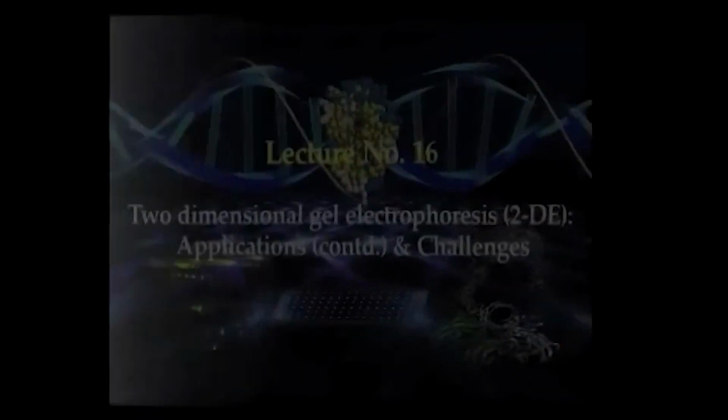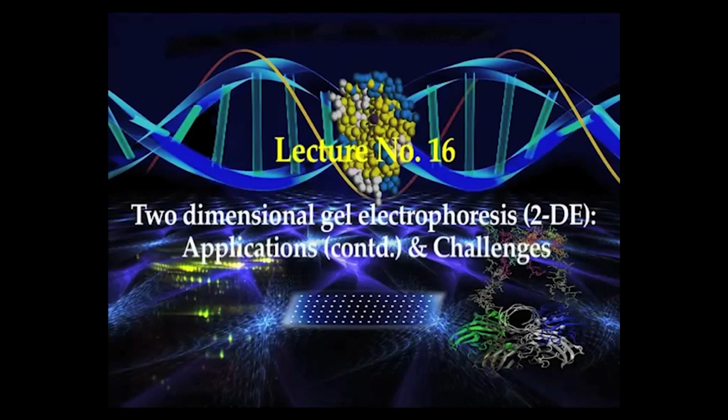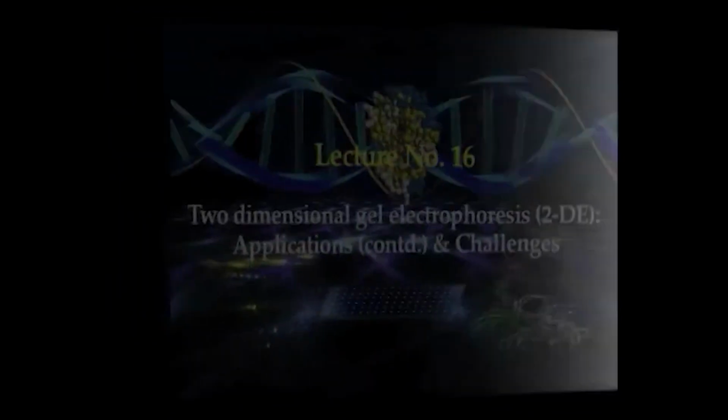In today's lecture, we will talk about applications of two-dimensional electrophoresis. If you recall, in the previous lecture, we started discussing some case studies about two-dimensional electrophoresis applications. So, as you have studied in this module, what are the different types of workflow involved in performing two-dimensional electrophoresis experiments.